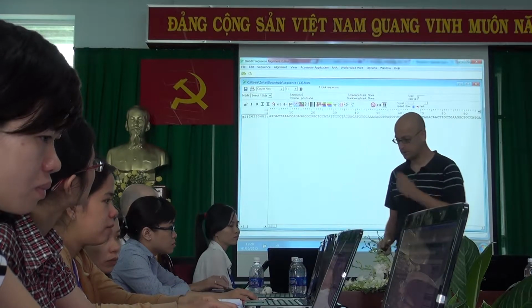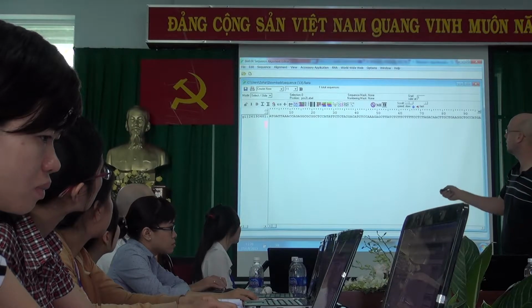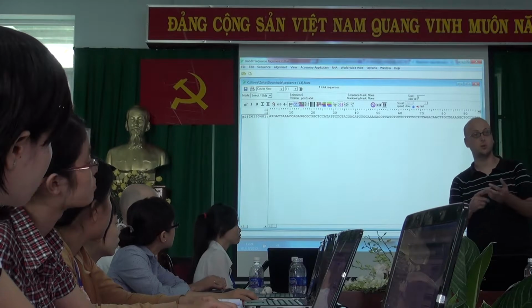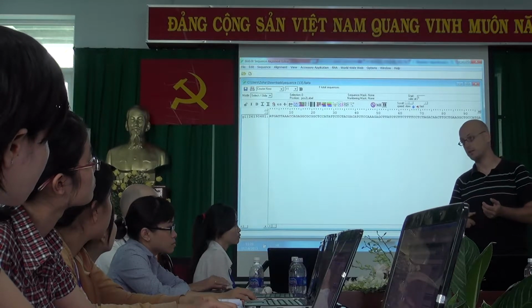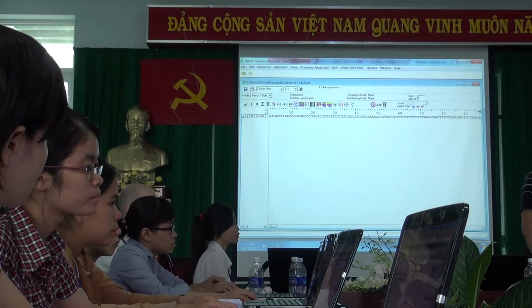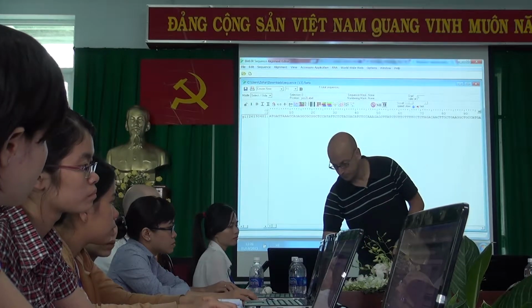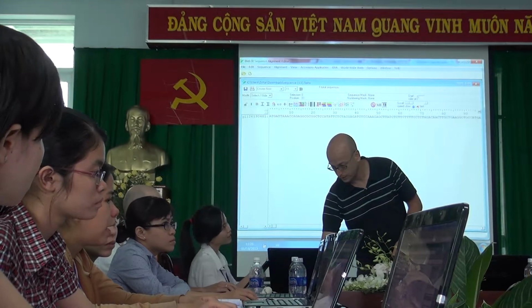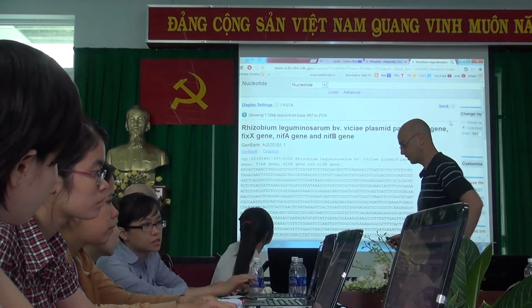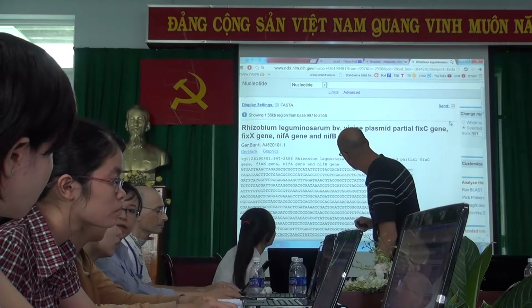And we can look at it. This is sequence software, but you can look at it in Word, in Notepad, in Excel, in whatever you want. So, yes. If you want to, set the promoter gene only.